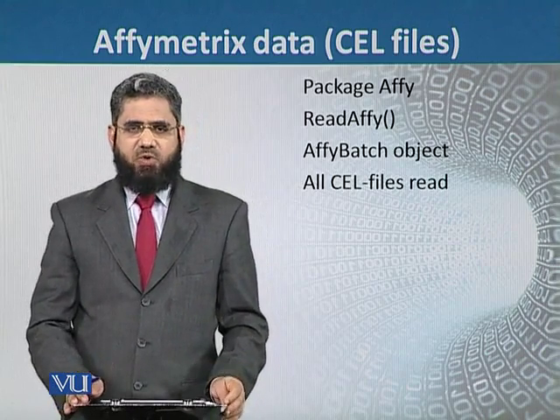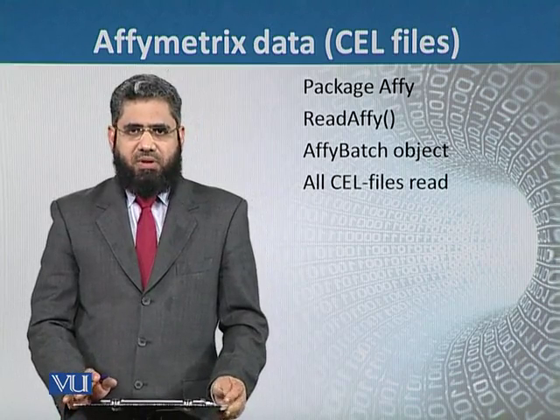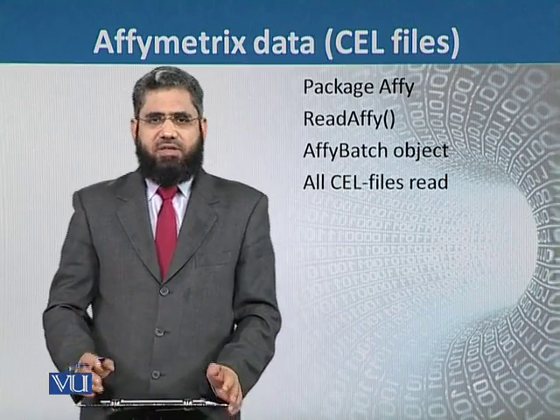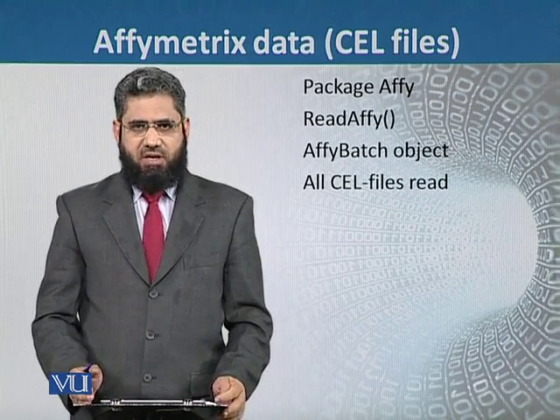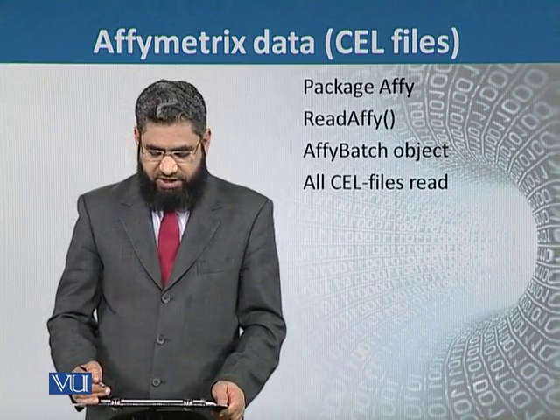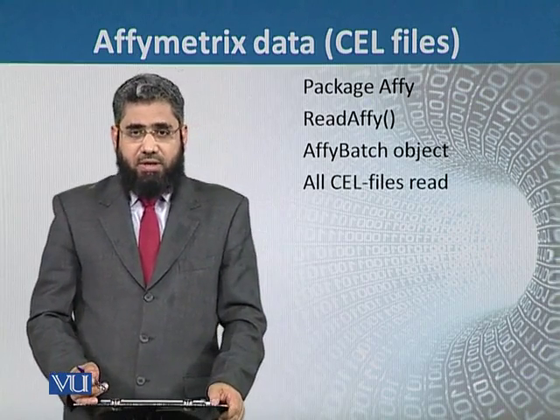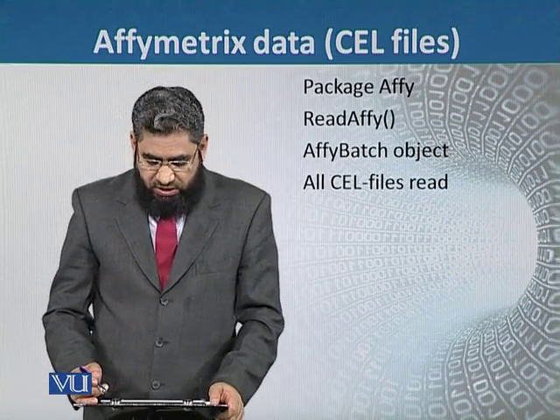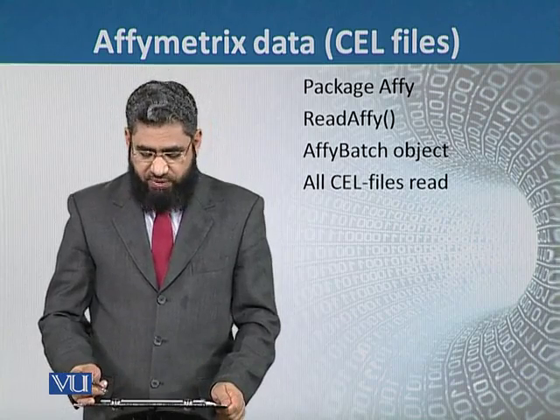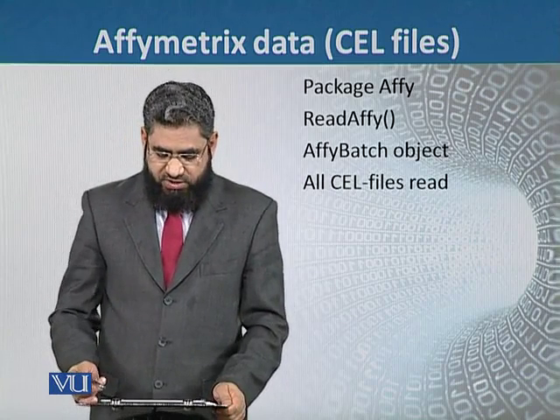So in short, I have told you how the data is generated, but now we will see how the data generated by these types of chipsets is imported. For example, if we use Affymetrix data, in R the package Affy is present, and we can use this package to analyze the Affymetrix data.